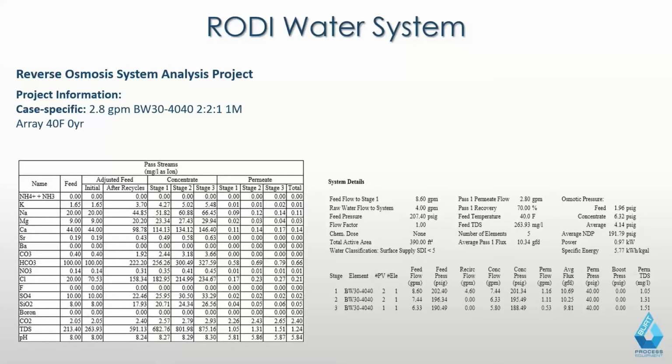I won't go through all the chemistry of this today, but what it's showing you is what I just described. You have your initial ion concentrations. You go through, and this is your permeate rate. As you go through your membranes, this is where you end up with your purified water. This can be adjusted as a means to optimize your high purity water generation.